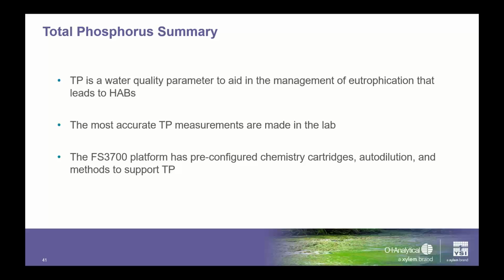Philemon has asked whether we have any remote sensing meters for the different parameters. That's a great question, Philemon. The EXO NitraLED sensor can be used for monitoring trends in nitrate and nitrite directly in the water. That EXO NitraLED sensor is definitely a game changer.